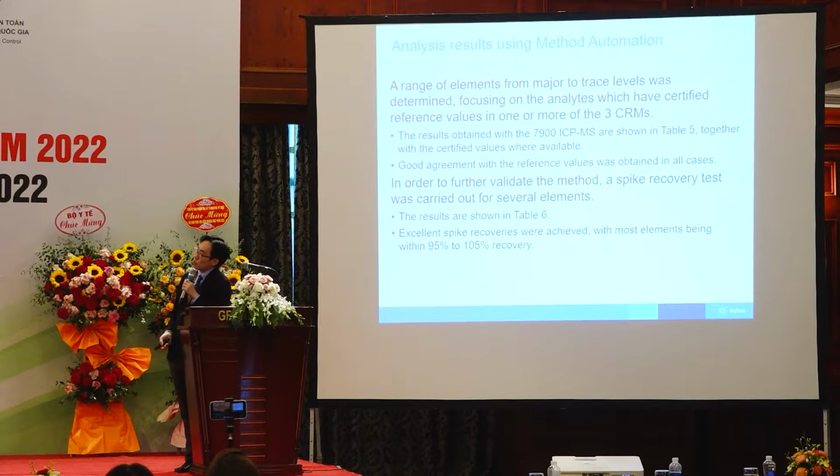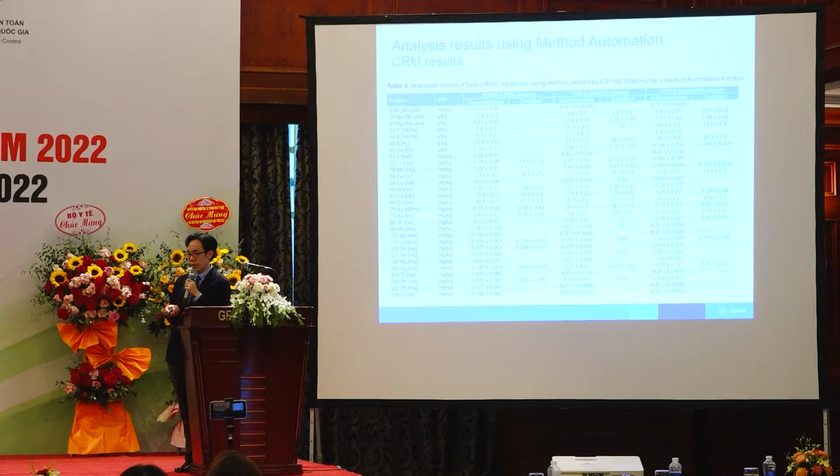The proof of whether this works or not is to run some actual samples. The application note describes what we have done to validate this method setup on the software. Three certified reference materials were prepared and analyzed with the method that was set up. I think there was some spike recovery done as well in the application note. I'll show you in the later slides.